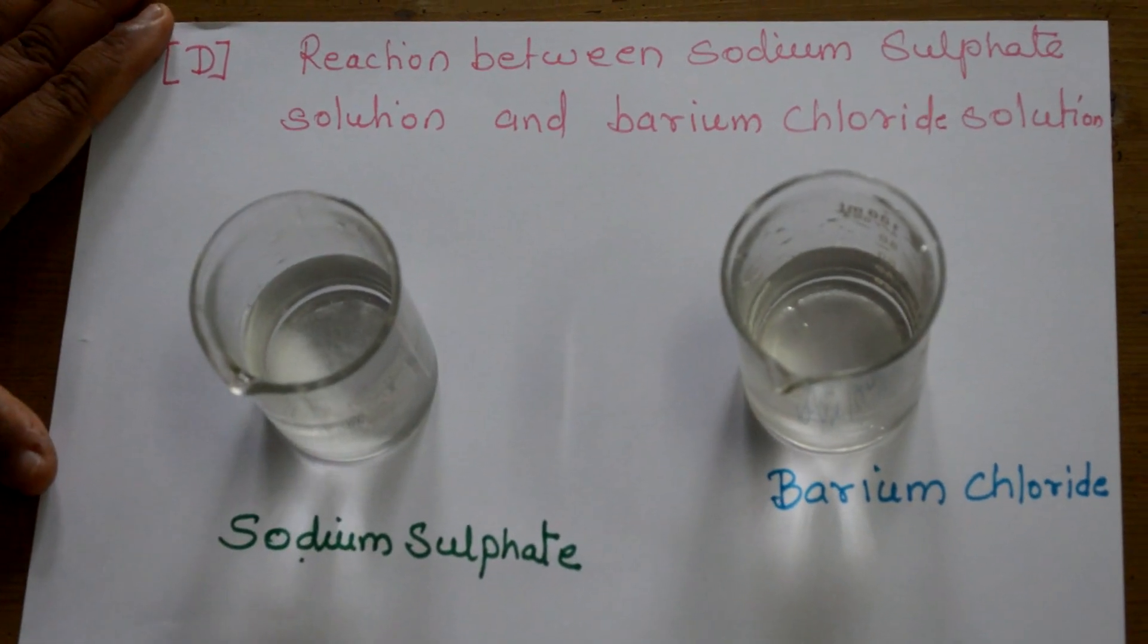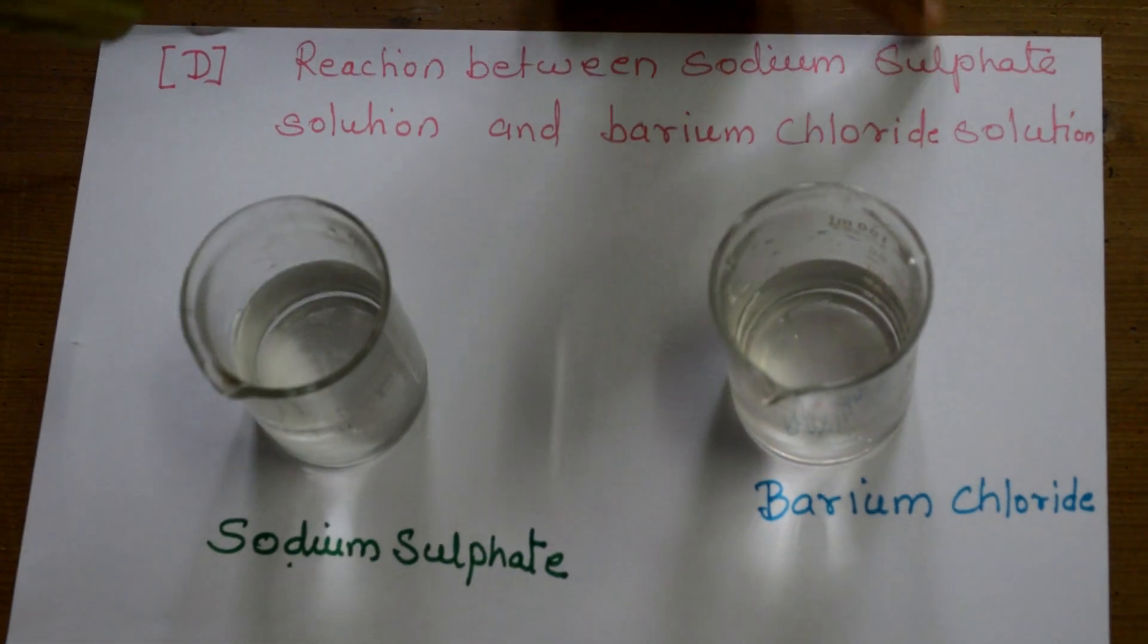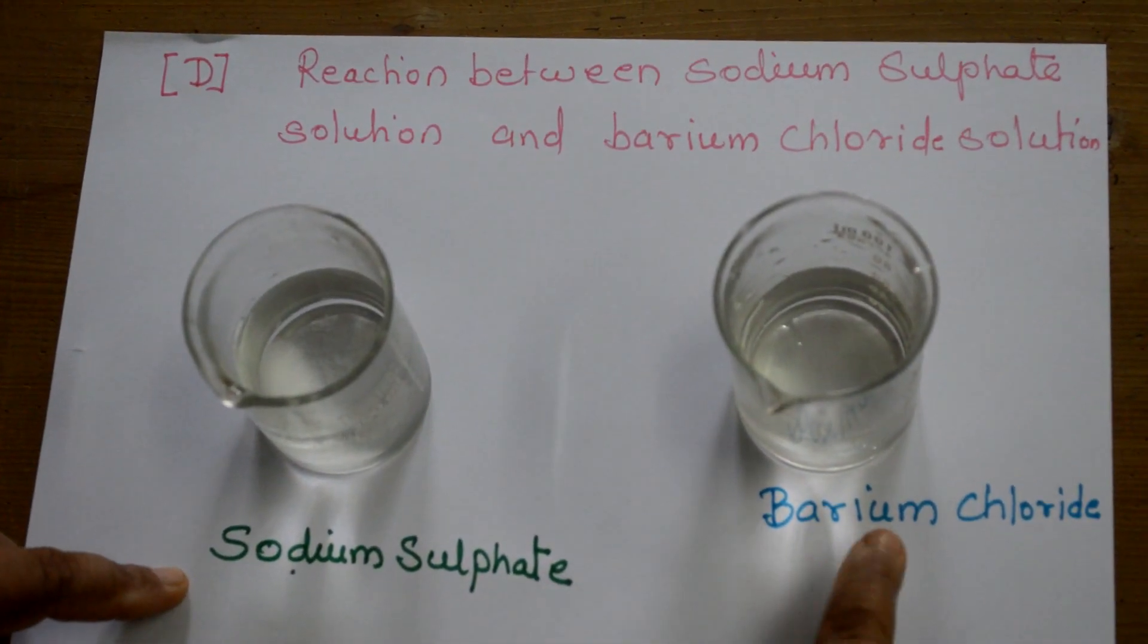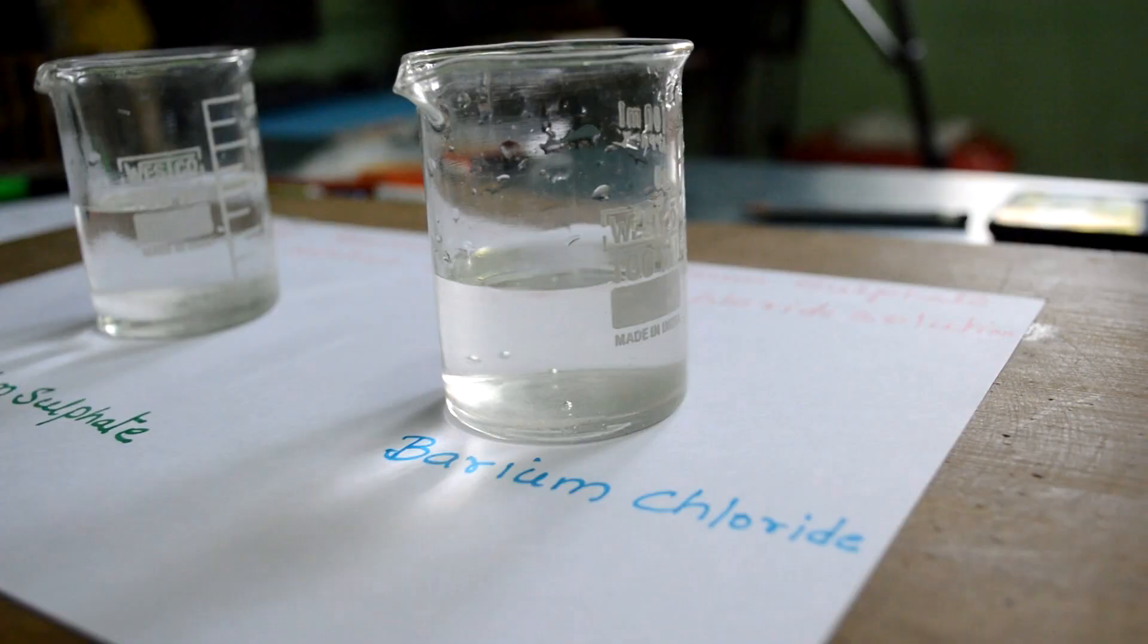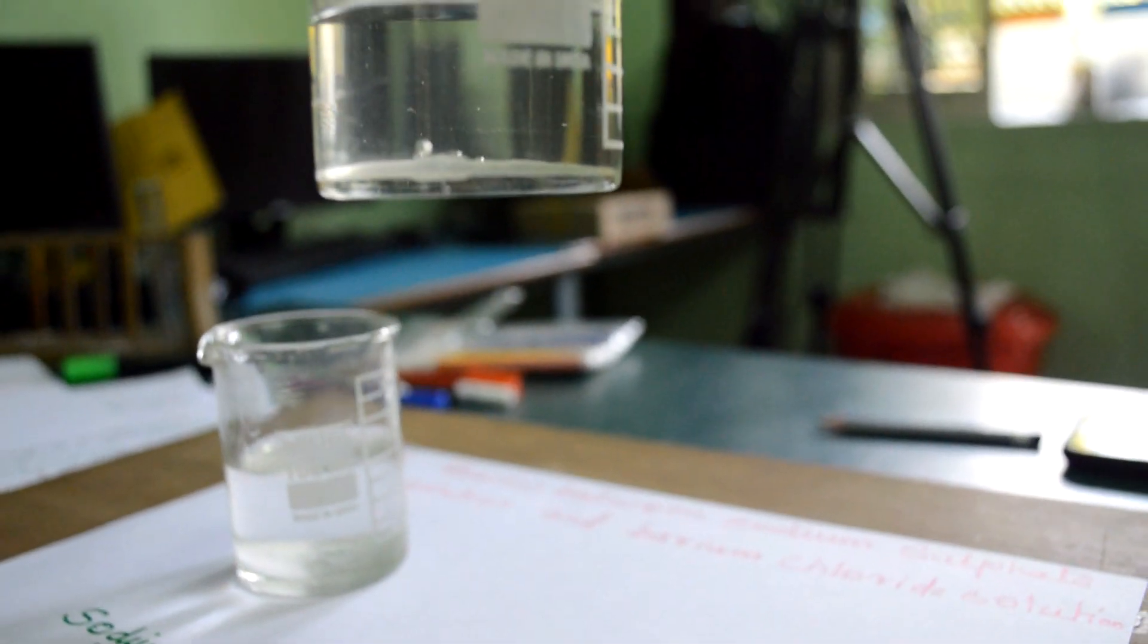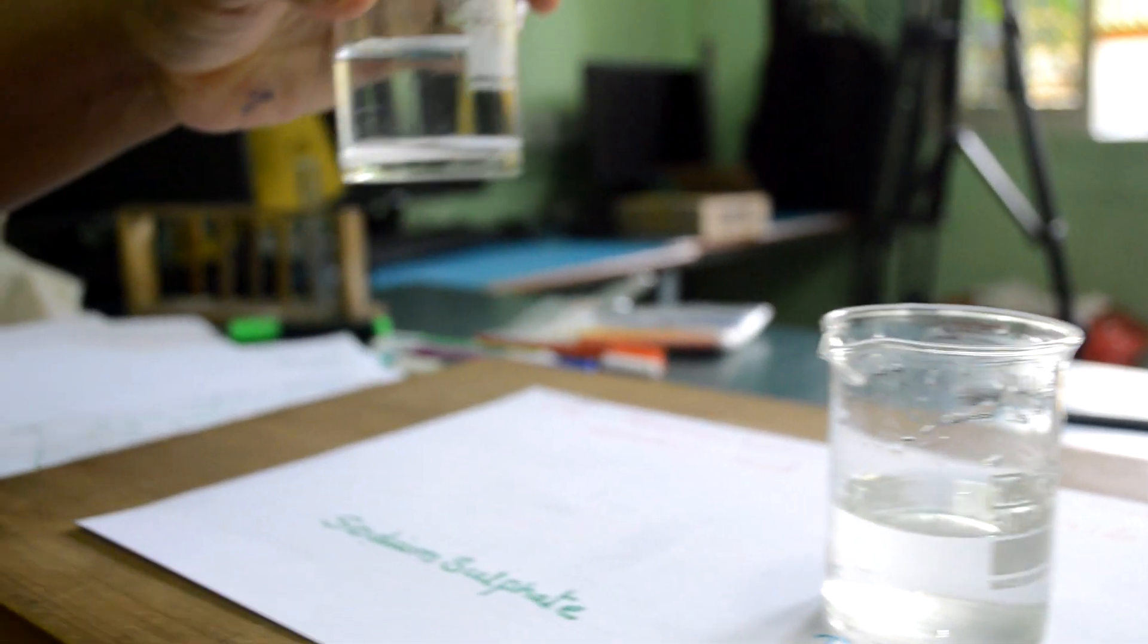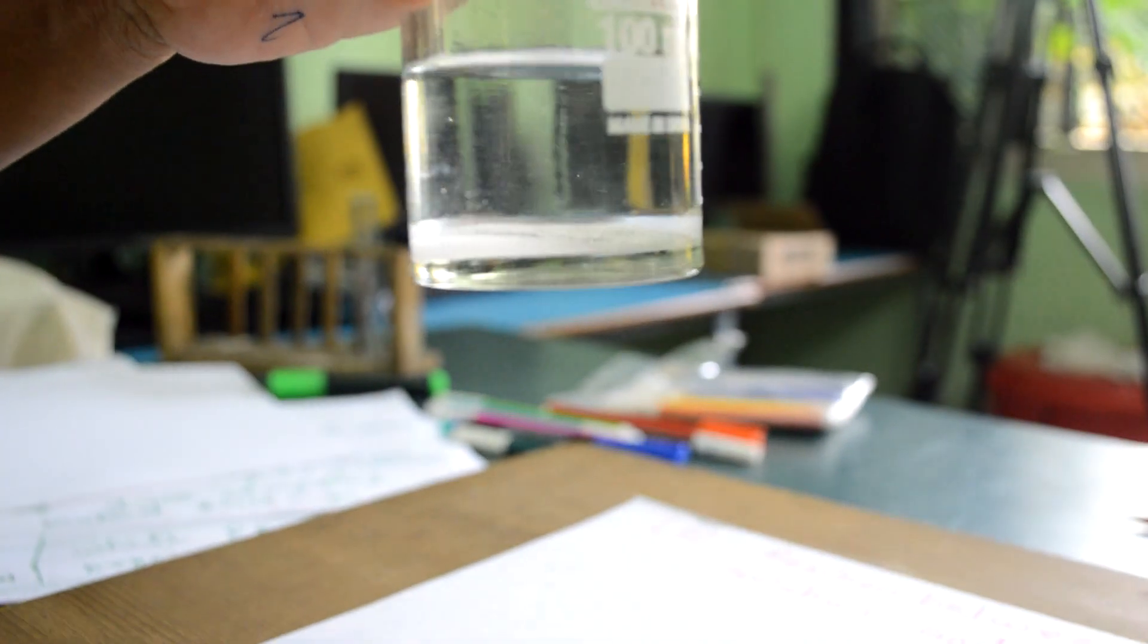Children, now we will be learning the reaction between sodium sulphate and barium chloride solution. You see, barium chloride solution is very clear and transparent. Same as sodium sulphate solution, it is also clear and transparent.